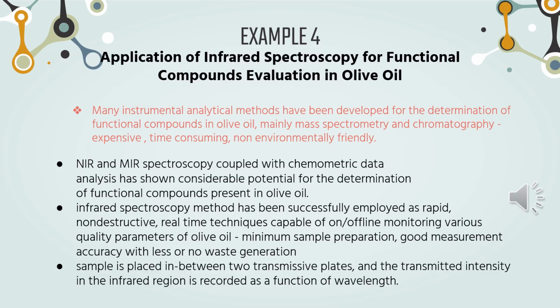Example 4. Application of infrared spectroscopy for functional compound evaluation in olive oil. Many instrumental analytical methods have been developed for the determination of functional compounds in olive oil, mainly mass spectrometry and chromatography.